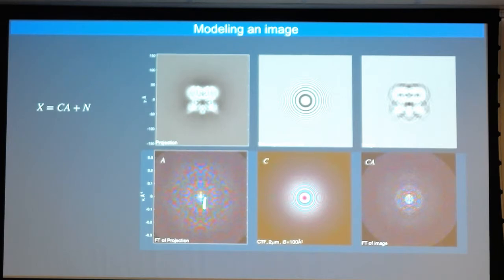So here's A, here's the Fourier transform of A, here's the CTF. Red means positive and green means negative, so this is actually an upside down CTF. Anyway, I multiply those two, and then I transform back, and I get my horrible looking defocus contrast image of my object. And the Fourier transform of the CTF is a point spread function. So if you're familiar with working with point spread functions, that says every point on here gets spread out into a pattern like that.